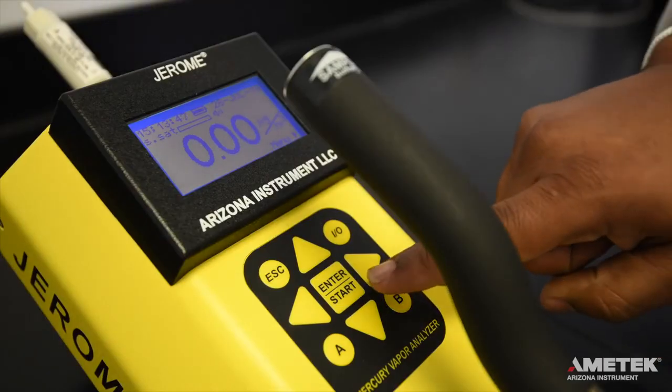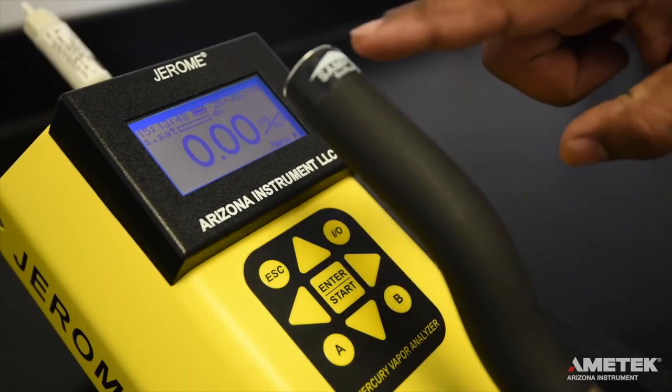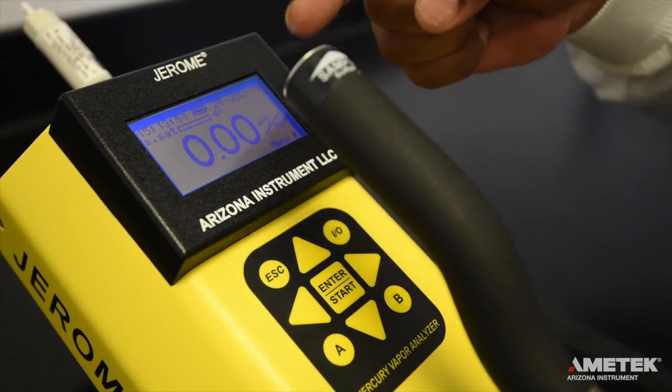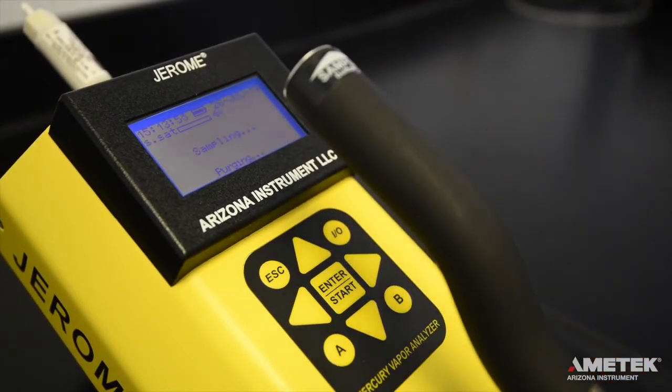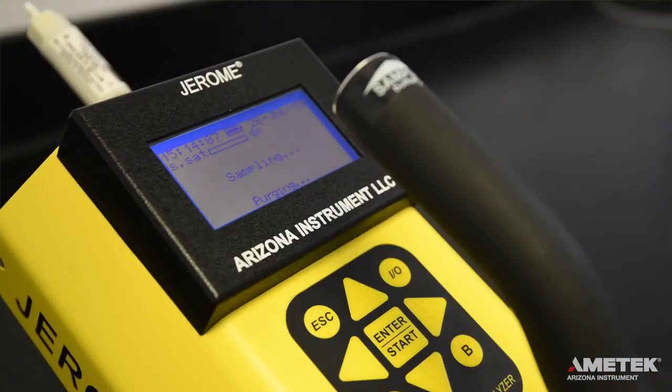To take a sample, press the enter button on the main screen or the silver sample button located at the tip of the handle. Readings should decrease and at least three of the five readings should be at 0.00 micrograms per meter cubed. If readings are not at 0.00 micrograms per meter cubed, contact Ametek Arizona Instrument or your local representative for assistance.